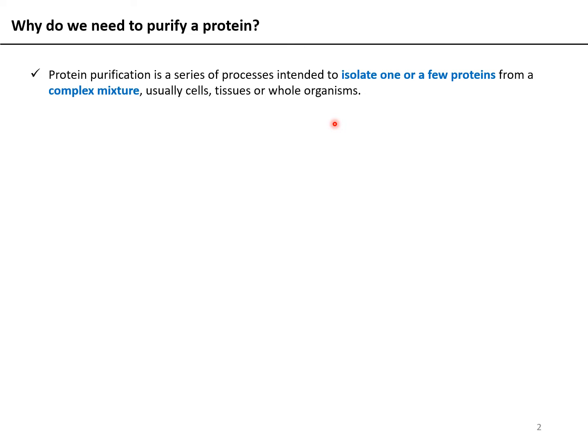If you have already gone through my previous lectures on co-immunoprecipitation, co-immunoprecipitation is nothing but a small scale protein purification technique whereby by doing co-IP, you can identify this protein A which is interacting with your known protein B. And once you have this protein A at hand, you can then do further analysis to identify the primary amino acid sequence of the protein. And from that, you can then simply determine the genetic sequence that would be responsible for encoding that particular protein.